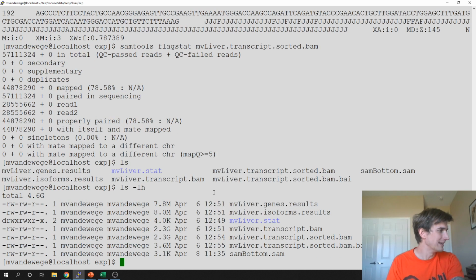All right, so what else is in our gene results? The BAM files are produced by Bowtie, or by any mapper, BWA, STAR, Bowtie2, whatever. As a segue, these BAM files, SAM tools, BWA, and another tool called BCF tools were all derived and designed by one person.